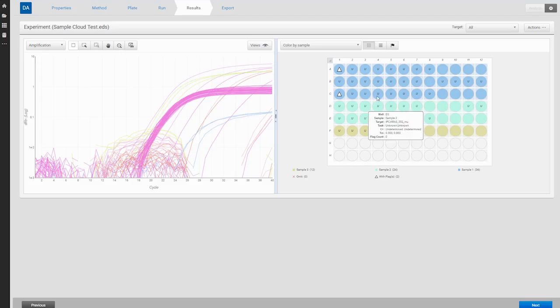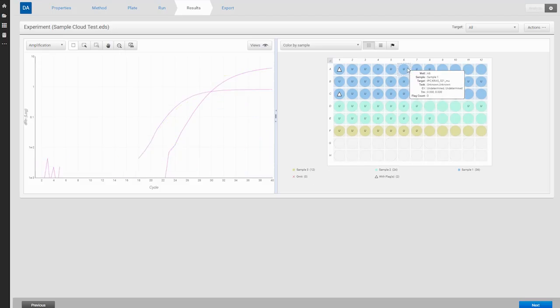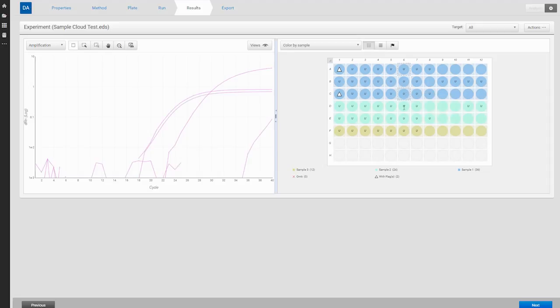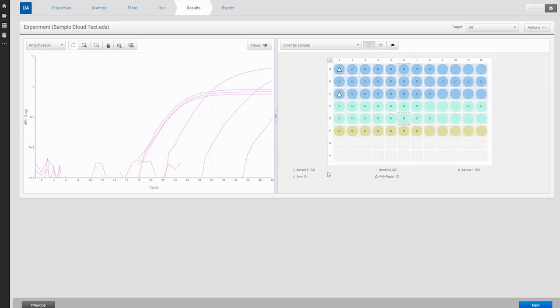Sometimes when you're running qPCR experiments, it can be difficult to distinguish real data from background signal, leaving you to wonder whether your data is real. Here are some of the parameters to check to determine whether you are looking at background or noise.